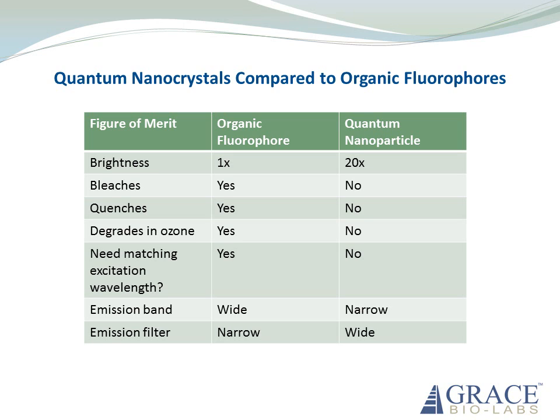The table included in this slide contrasts the characteristics of conventional fluorophores and QNPs. A very important point here is that QNPs, when stimulated with ideal excitation sources, are as much as 20 times brighter than organic fluorophores, the same as saying the extinction coefficient is 20 times greater.